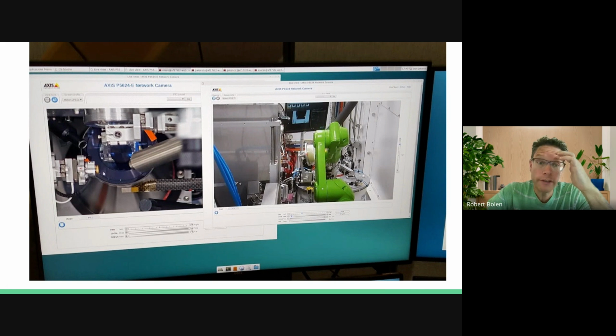So in the picture to the left, there's a tiny little magnet on that, and the pin with our loop on it will actually be attached to that magnet. And there's a robot that mounts it, and the robot here is a green one. We call it Kermit, like Kermit the Frog. That's actually what the scientists named it, not us. It'll mount the crystal, and then that will allow the X-rays to pass right through it.